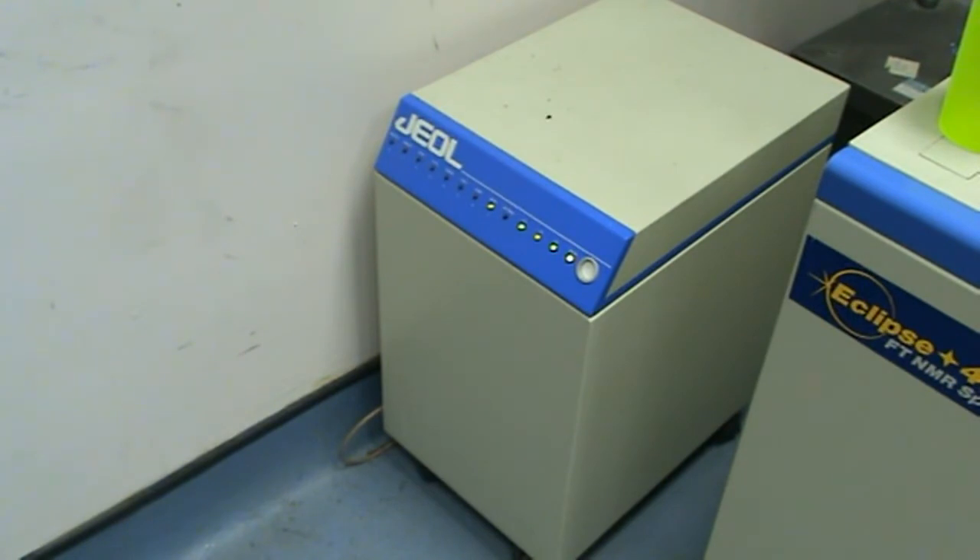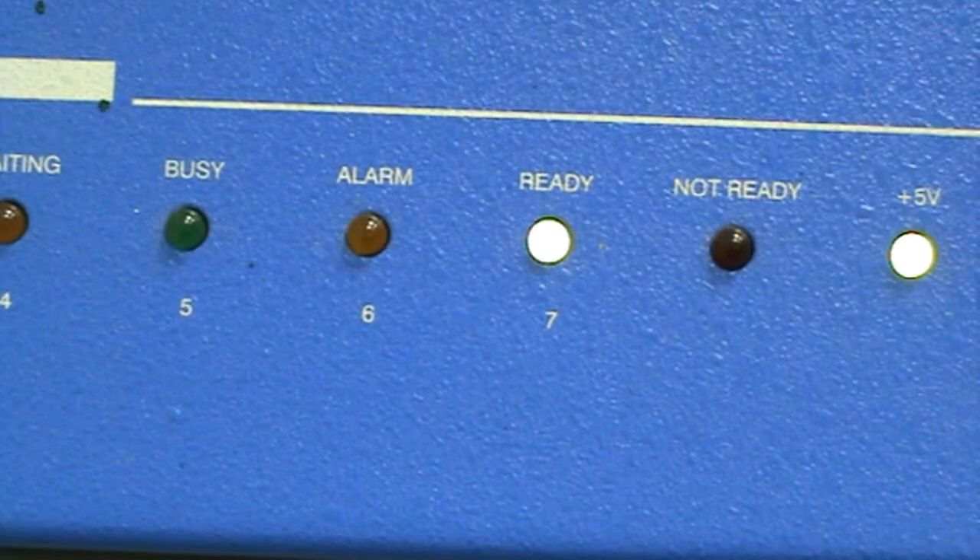The ready light should be lit, and if the NMR is processing a sample, the busy light may also be lit. If the red alarm light is lit, please inform Dr. Lewis, Bob Knight, or Rob McDonald immediately.